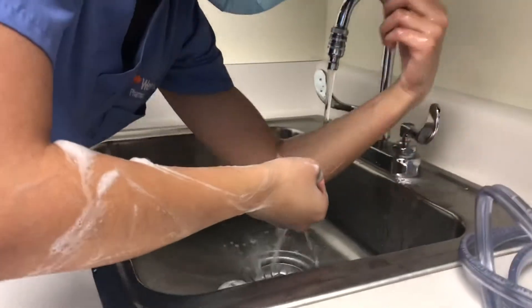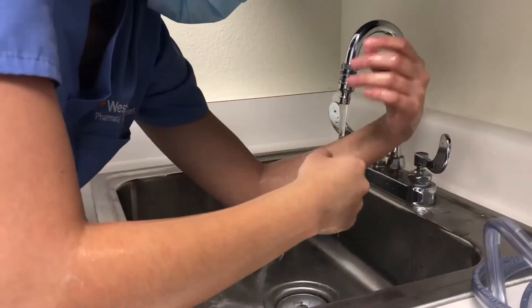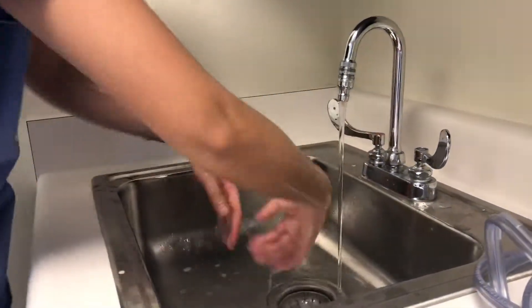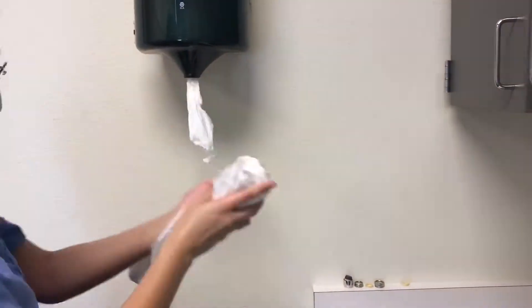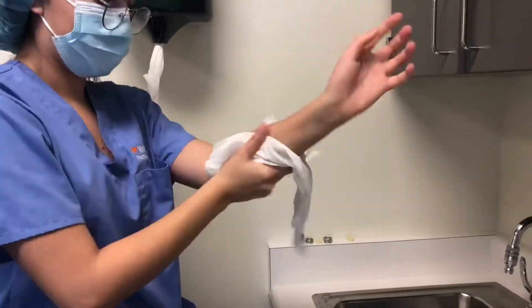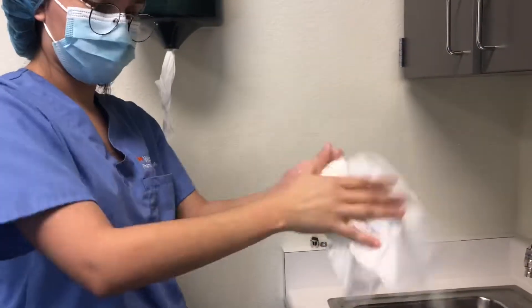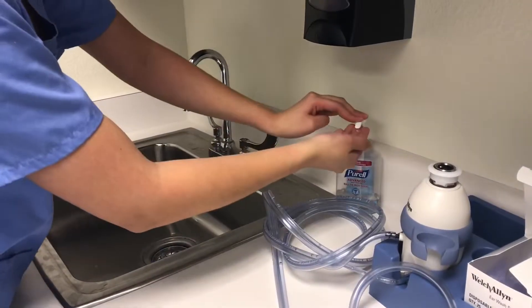Now rinse your hands, making sure not to touch anything, and let the water run down to your elbows. Now dry your hands with lint-free paper towels. Once your hands are dry, sanitize them.